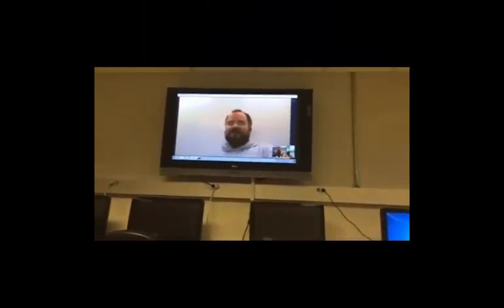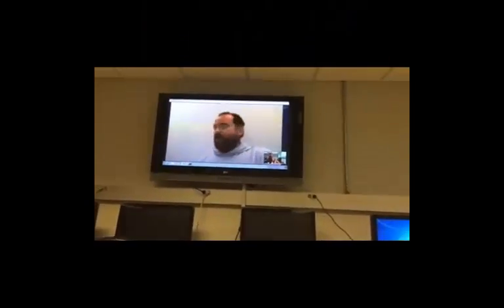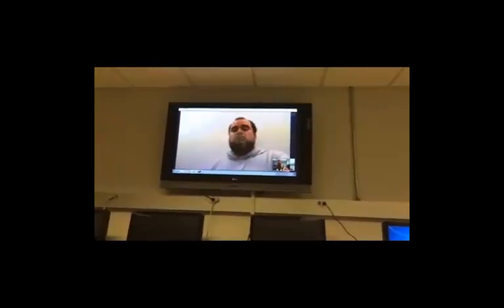Now, what I'm going to do tonight is show you, hopefully, if I back up, using this handheld web camera, what the actual instrument looks like. This is something you can have the opportunity to do here, but we're hoping you can see what the equipment looks like. First of all, this is where the LC mass spec is currently stationed. It's a small little room here at Dominguez Hills.